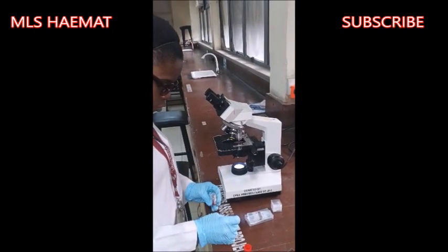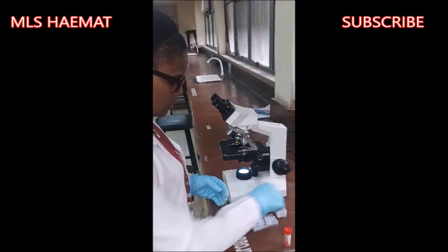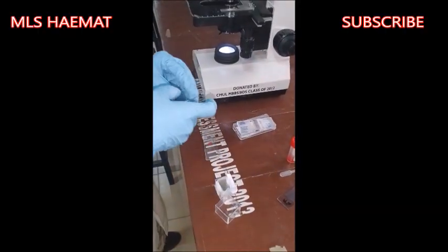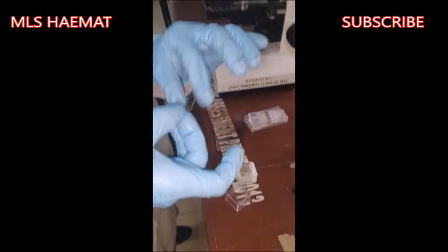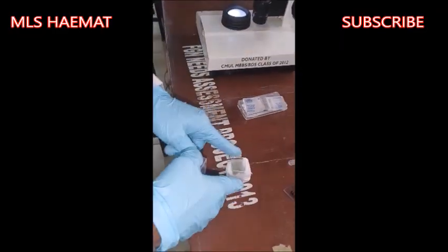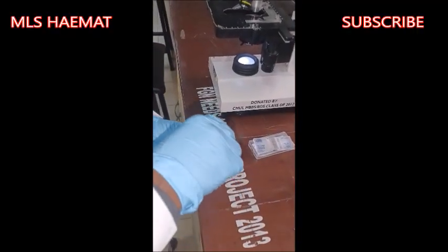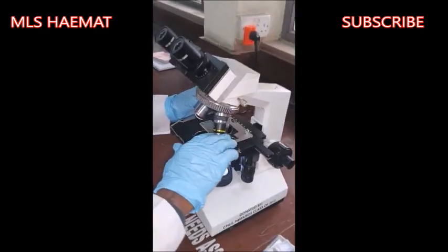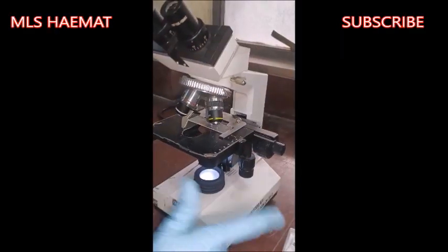So I'll just place a drop of it on the glass slide. Afterward, I'll get my cover slip. So this is a cover slip, in case you are wondering what a cover slip is. I'll place the cover slip on top of the drop of blood that I have placed on the glass slide. Then I'll place the glass slide on the mechanical stage and clip it with a stage clip.